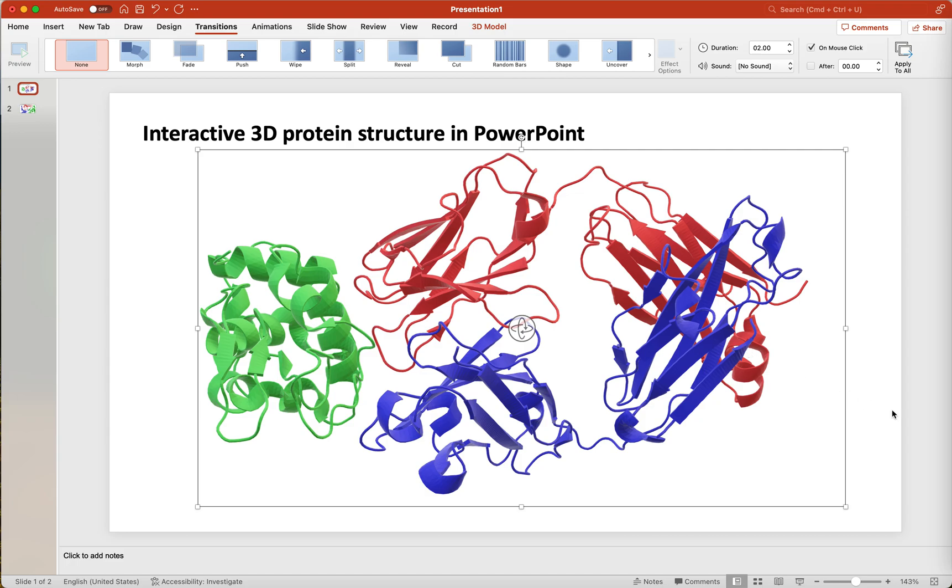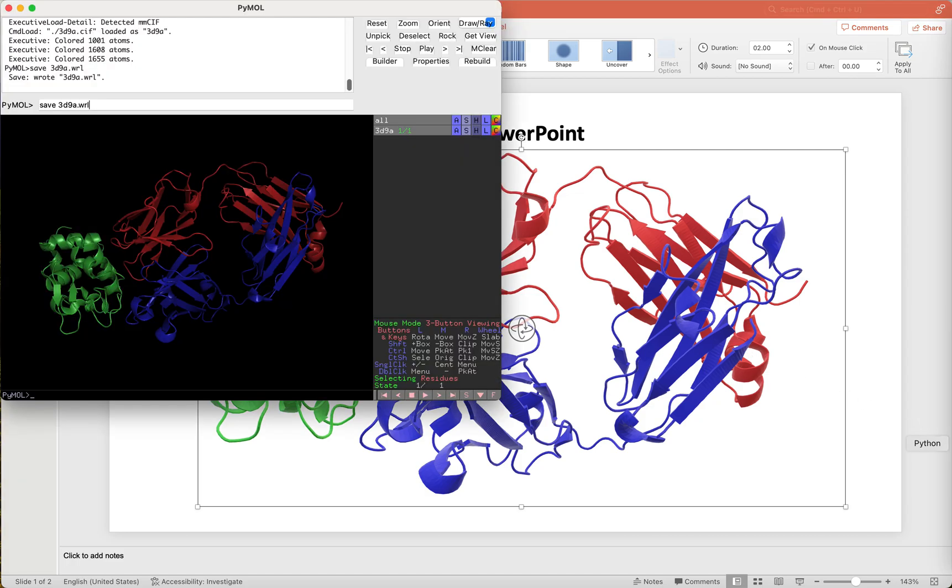To do this, open PyMOL, read in your PDB file, and choose the protein structure representation.